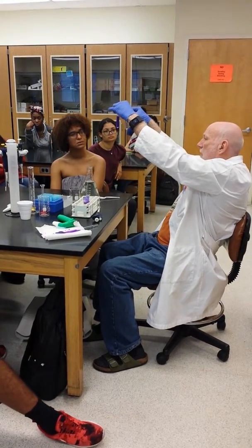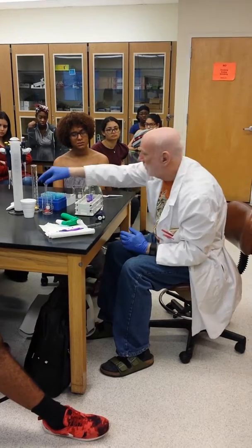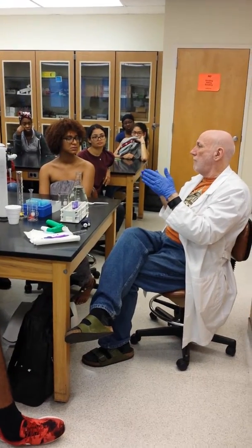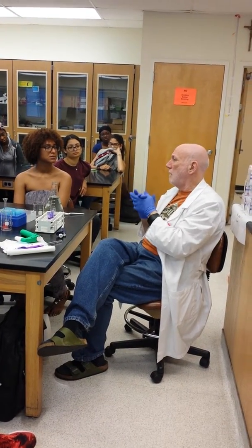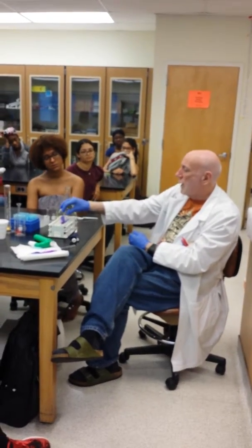See a difference there now? I could do this again. I could take, well, you get the picture. The lavender color would get fainter and fainter. And by the time you're down to 100,000th, a millionth, you wouldn't see any color. All you would see was practically just the water. There would be very little solute. This is the same thing.